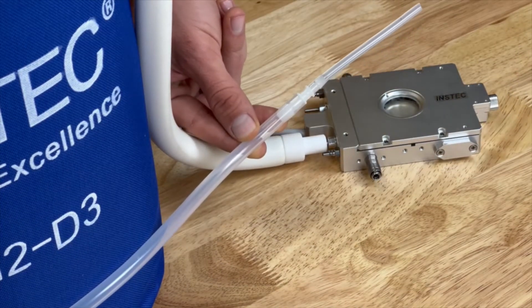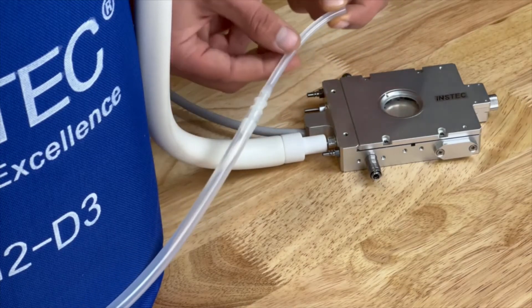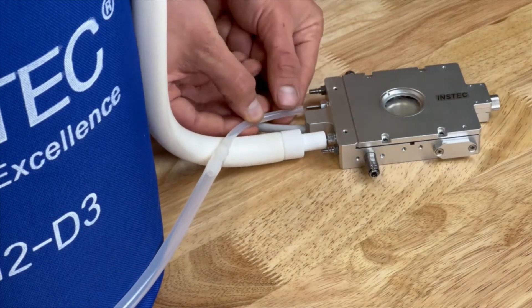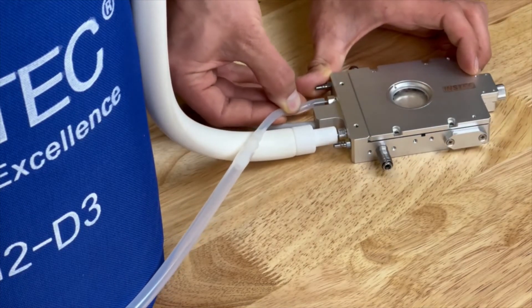Next connect the outlet tubing. A tubing reducer will be provided if needed like the one shown here. The thermal plate has no preference for which is the inlet and the outlet port, so feel free to use whichever is convenient.